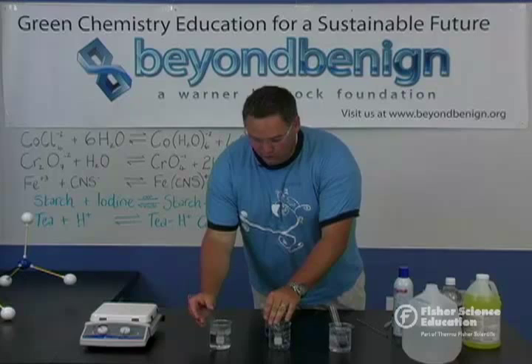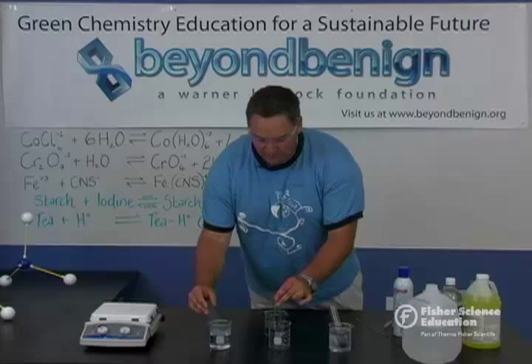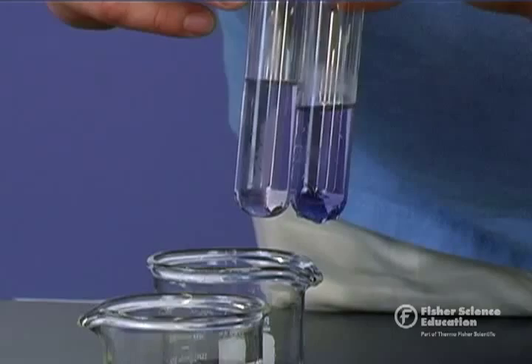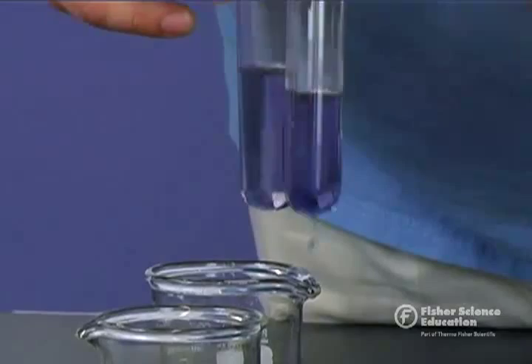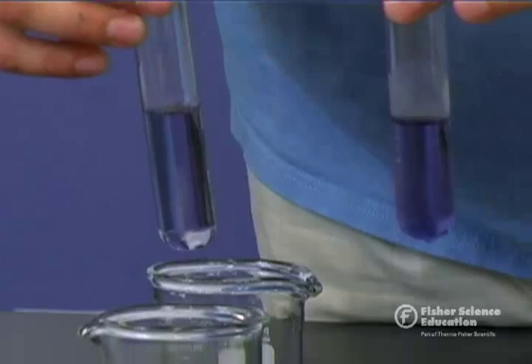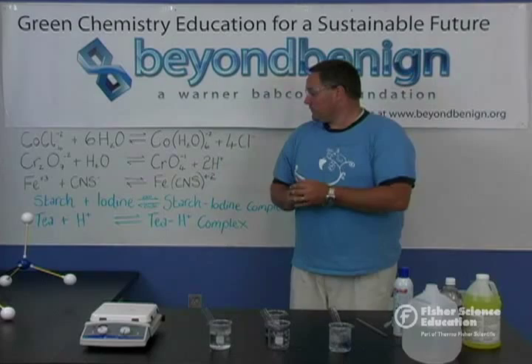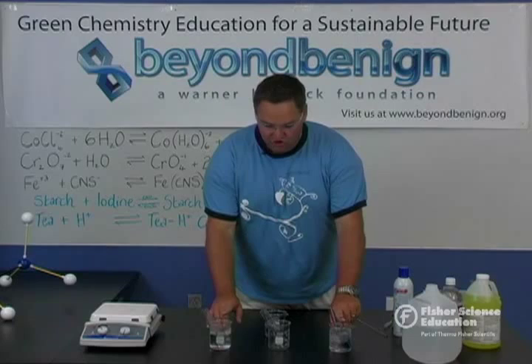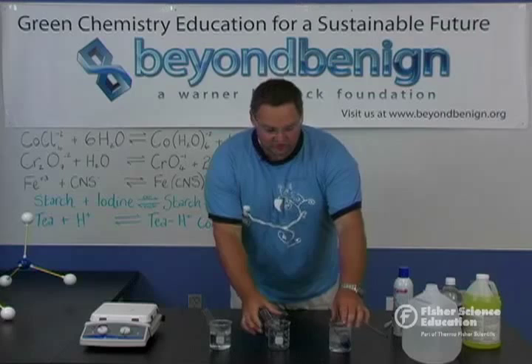Examining our warm water solution, we see that the colored starch-iodine complex has almost completely shifted away when compared to our control. When we compare our chilled sample to our control, we see that the equilibrium has shifted to produce more of the starch-iodine complex. This equilibrium can be shifted back and forth multiple times — we could shift our chilled sample back to the warm and return to the clear solution if desired.